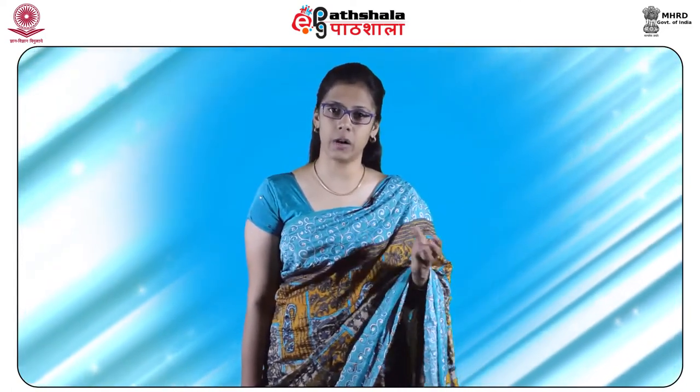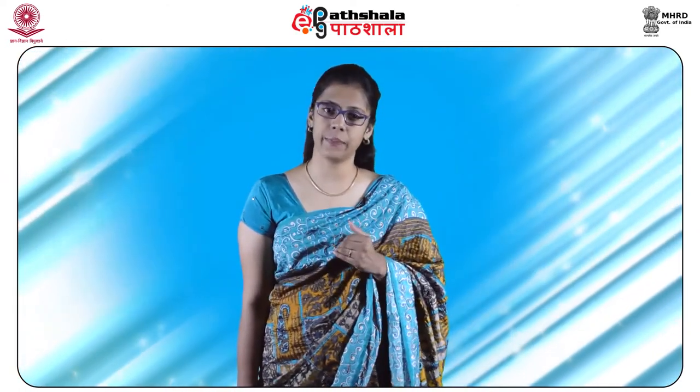Now, the next step is dye analysis by high performance liquid chromatography, that is HPLC. This technique was introduced around 1960. In forensic science, this technique has been widely applied for qualitative and quantitative analysis of drugs and metabolites, organic and inorganic explosives, marker dyes and inks. There are various advantages of HPLC over TLC, for example, better resolution of dyes, quantitation and consistent retention times of separated components.